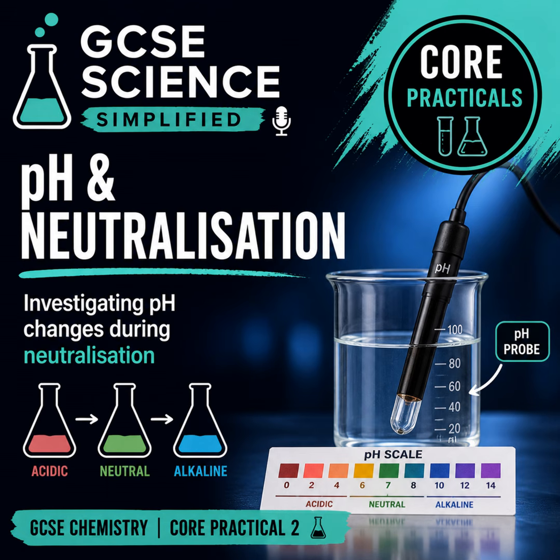Here's the setup. Let's take a fixed volume of dilute hydrochloric acid. Then you add measured amounts of calcium hydroxide, and after each addition you measure the pH. And this is crucial. You're not just doing it once, you're building a pattern over and over again.